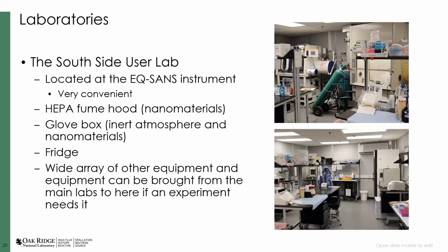There are also laboratories that are really close to the beam line. In the case of the EQ-SANS instrument, our hutch is right next to the laboratory at the beam line called the Southside User Lab. Very convenient for people who are working on SANS, who want to do time resolved things where they have to mix something really quick and then run it into the instrument.